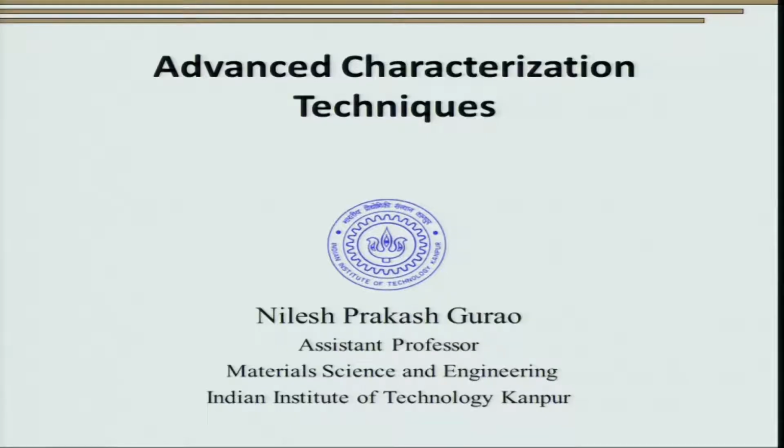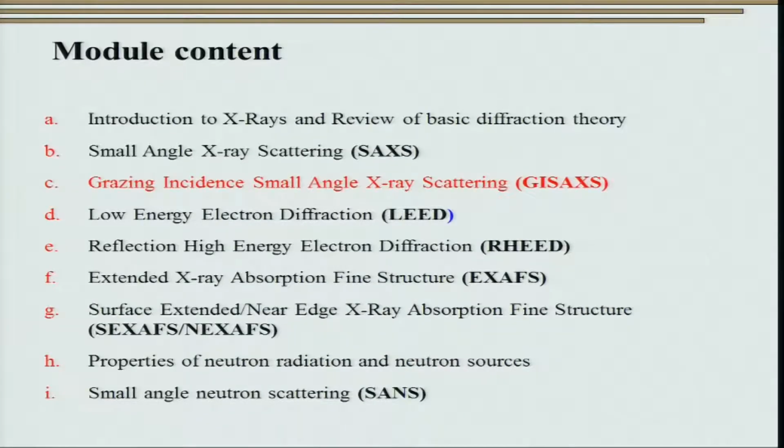Today's class on advanced characterization techniques, we are going to talk about a new characterization technique known as grazing incidence small angle X-ray scattering. In the last class, we had studied small angle X-ray scattering, and we understood how small angle scattering can help us learn about the distribution of sizes as well as the shape of different particles and precipitates in a variety of materials.